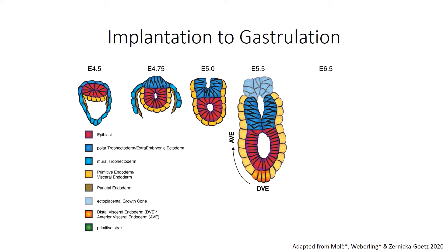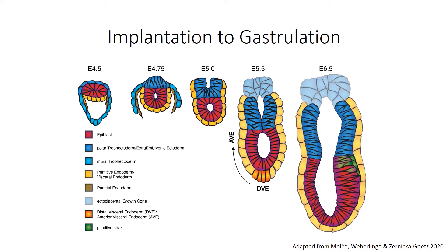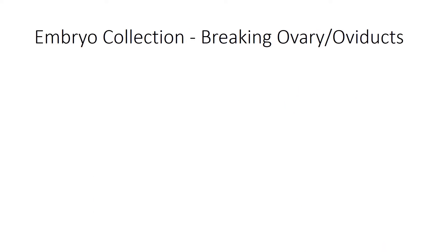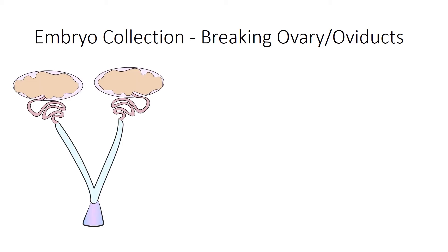This group of cells migrates to the future anterior of the embryo, thereby defining where the head is going to be. At E6.5, the primitive streak forms at the posterior end of the epiblast and initiates the process of gastrulation. If we now want to culture and image these embryos at different stages of development, we have to recover them from the mouse reproductive tract, which is composed of the ovary enclosed by the ovarian bursa. The ovary itself is attached to the oviduct, which leads into the uterus — two long tubes interconnected at the cervical region where they end in the vaginal vault.